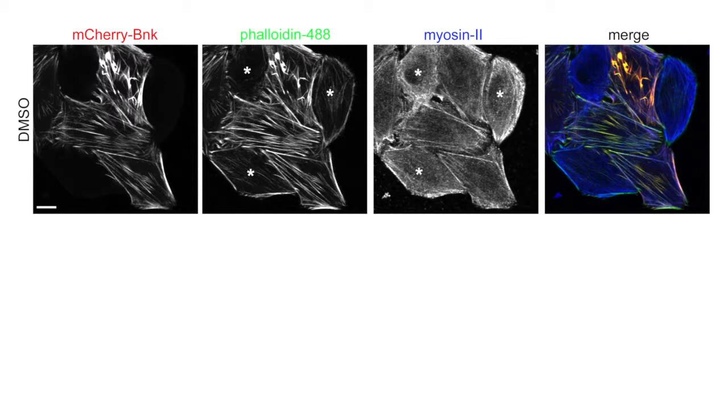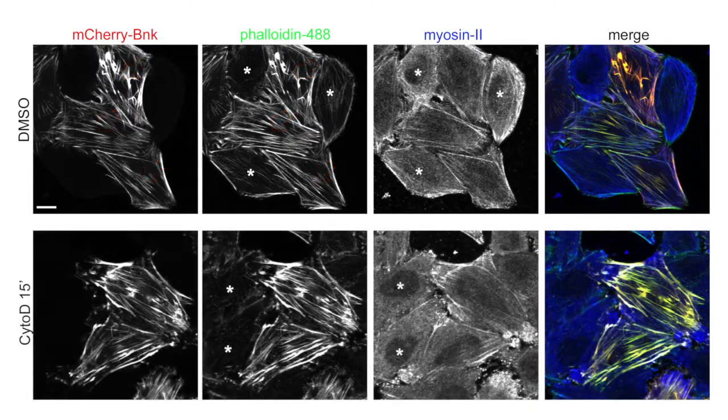overexpressed the protein in HeLa cells. And what we found actually was very striking. Bottleneck localized to filaments in HeLa cells, and these filaments resembled stress fibers, and the level of actin on the stress fibers was drastically upregulated. And the third important result of this experiment was that the stress fibers became completely resistant to actin depolymerizing drugs.